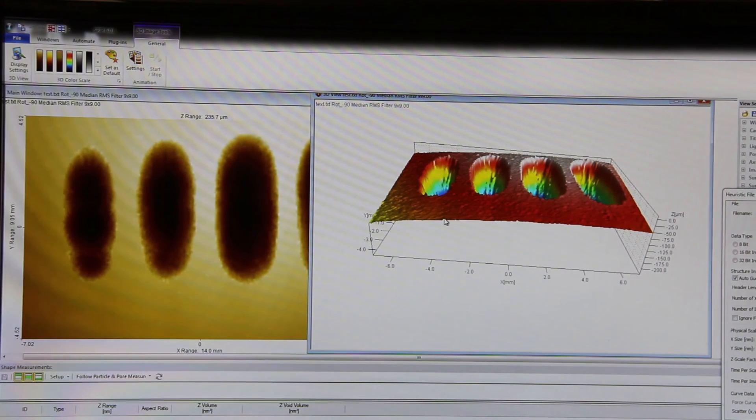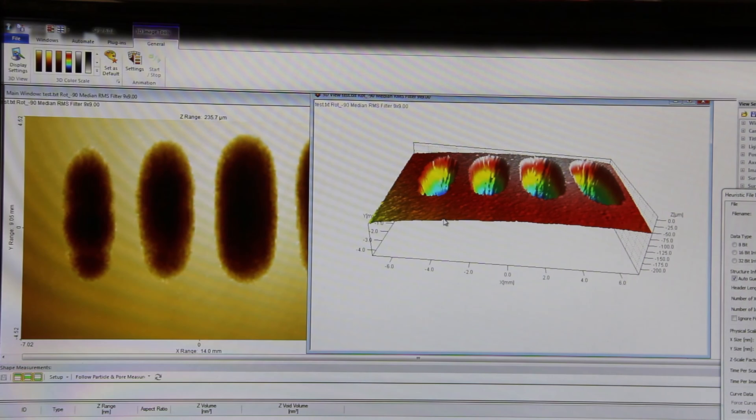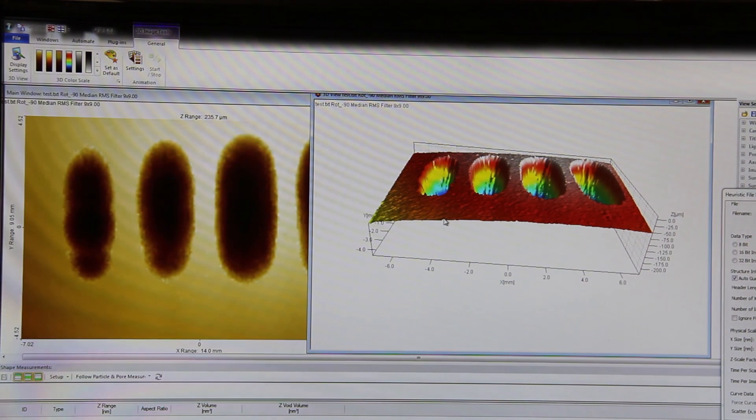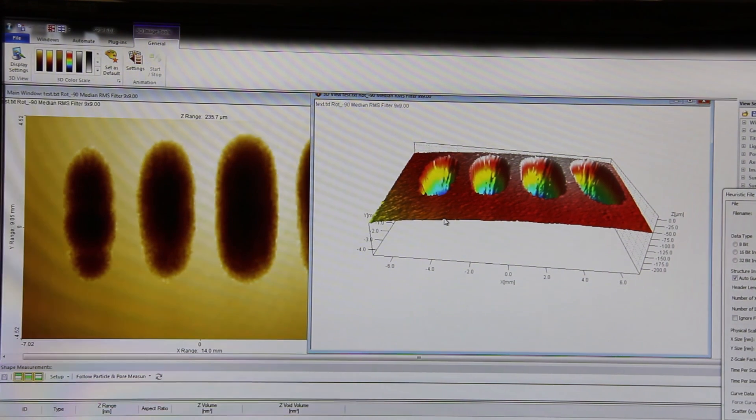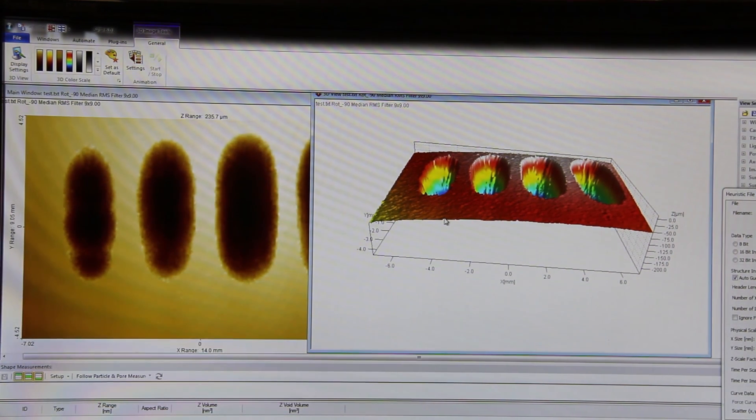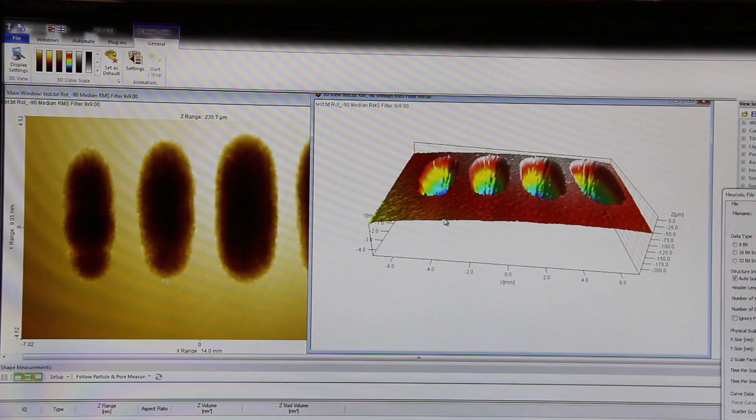Remove your sample from specimen holder. Put the hood back in. Turn off the still initial chromatic sensor and turn off the motor.